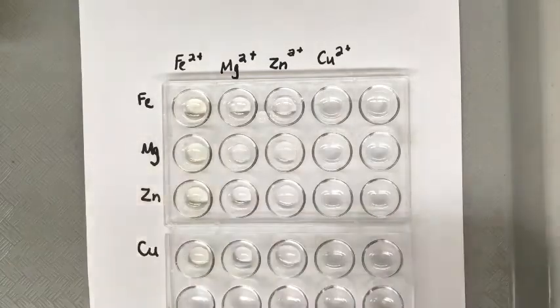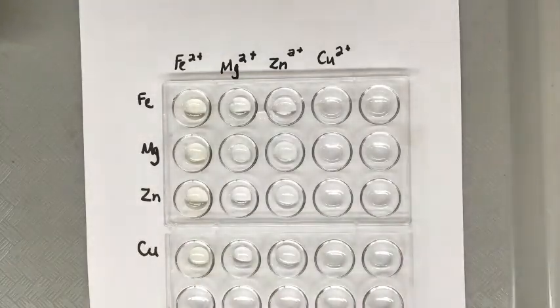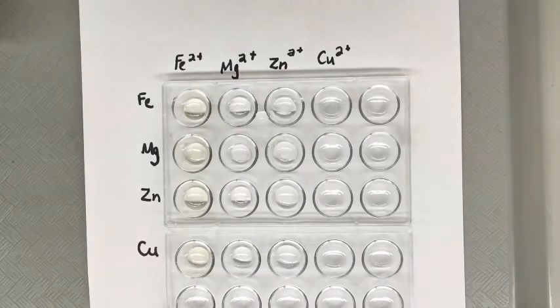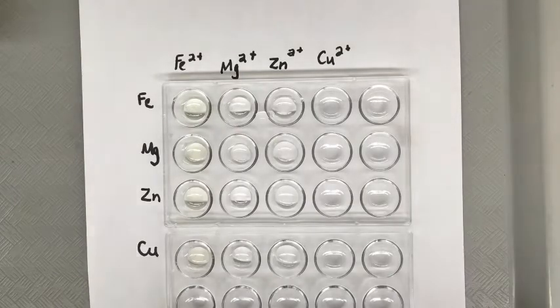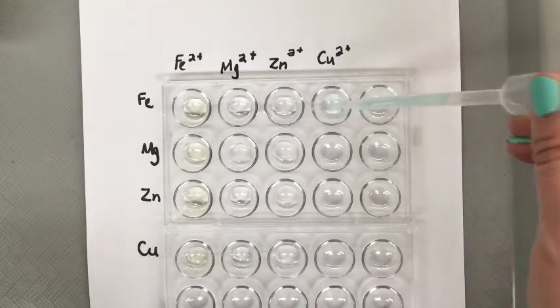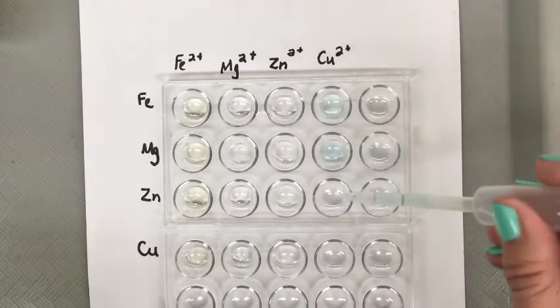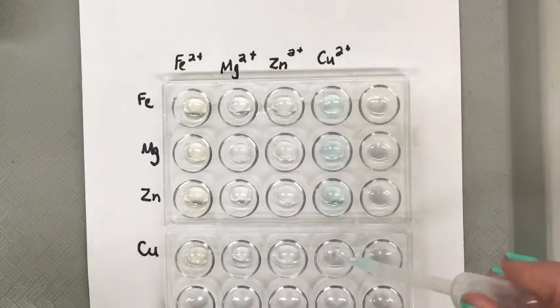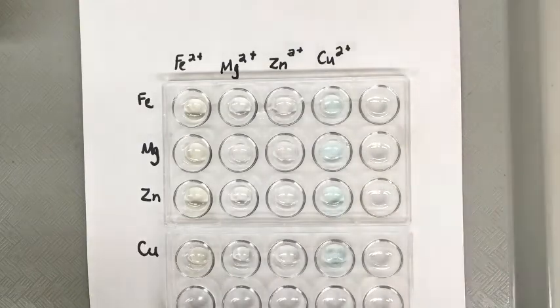Finally, we'll put a copper solution in our last column. There we go. So our solutions are prepared.